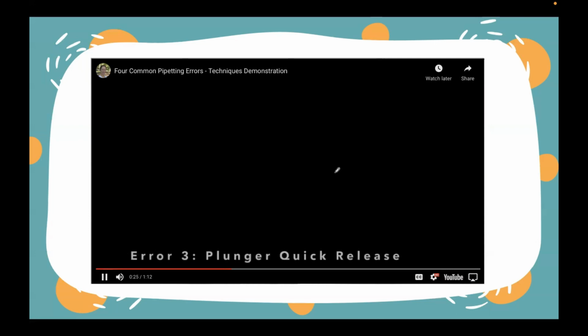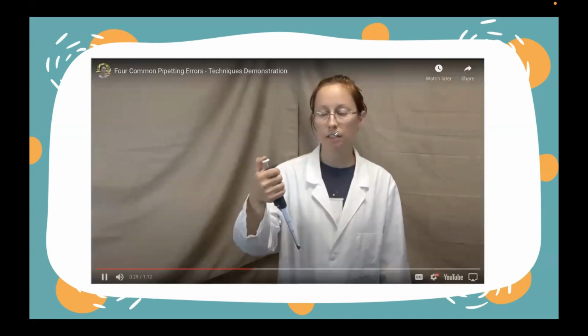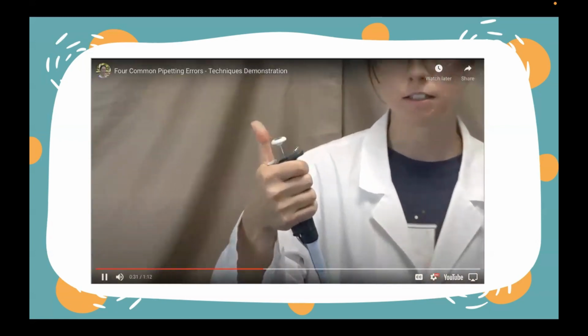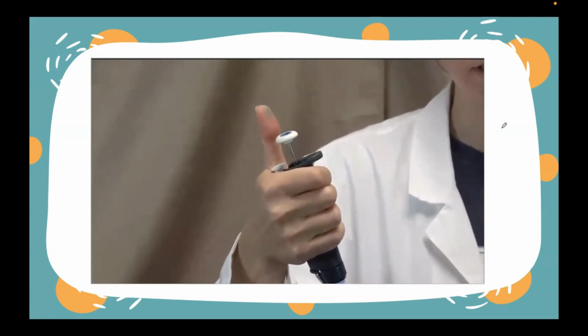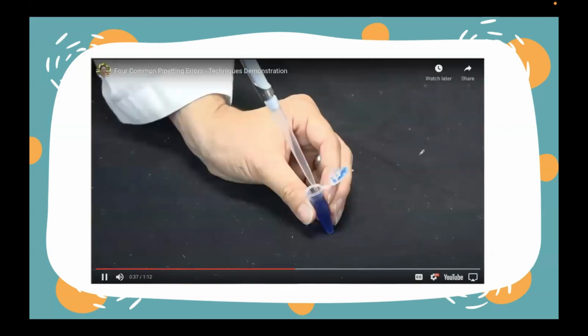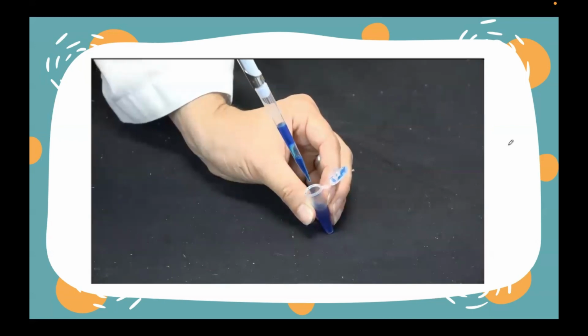Next, remember to always let the plunger up slowly. Let it up too fast, you're likely to throw an air bubble up into the pipette tip. Wag yung sobrang bilis. Kasi mag-introduce ka ng air bubble. Ayan o, pag sobrang bilis. Hindi rin naman po dapat sobrang bagal.